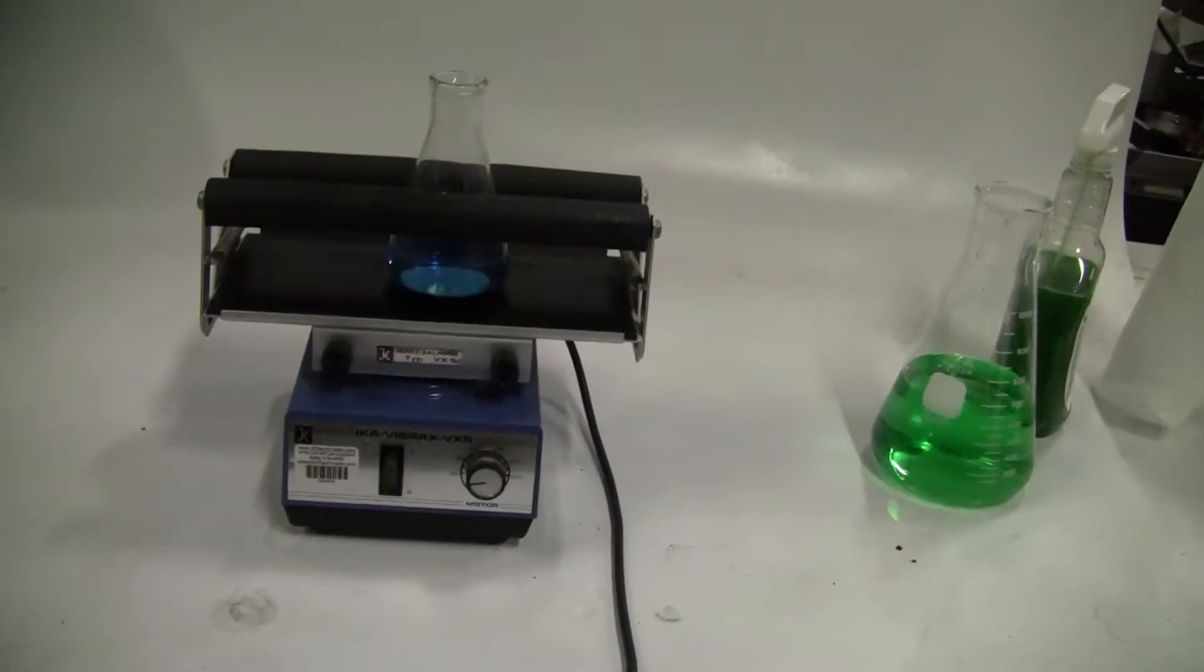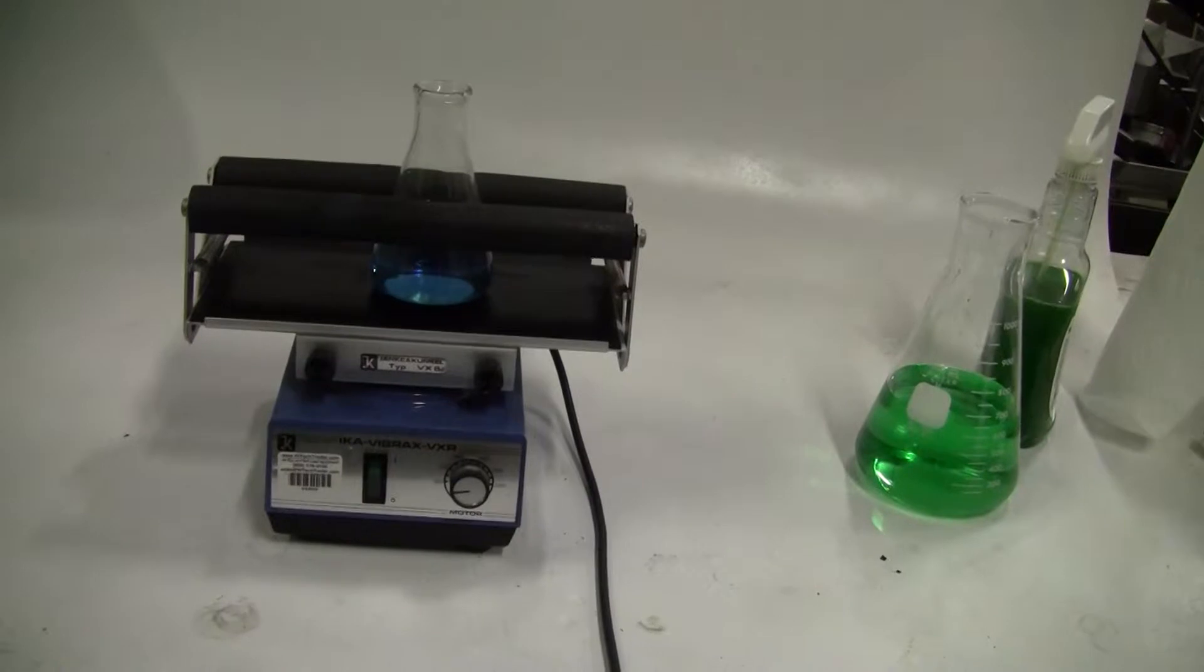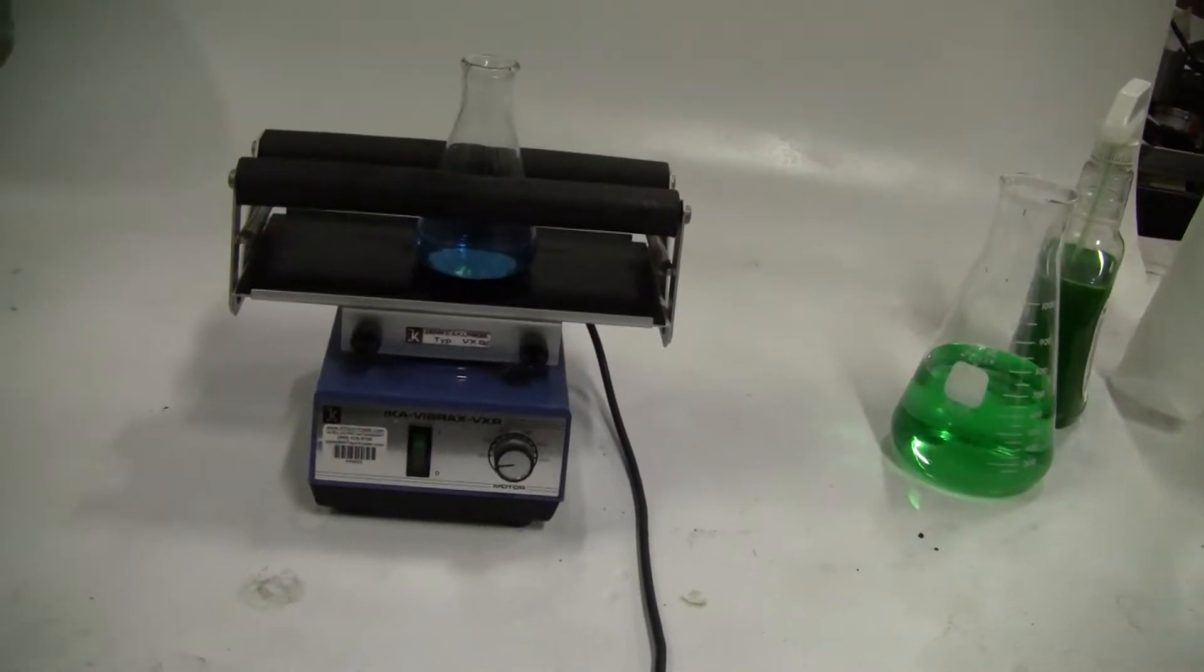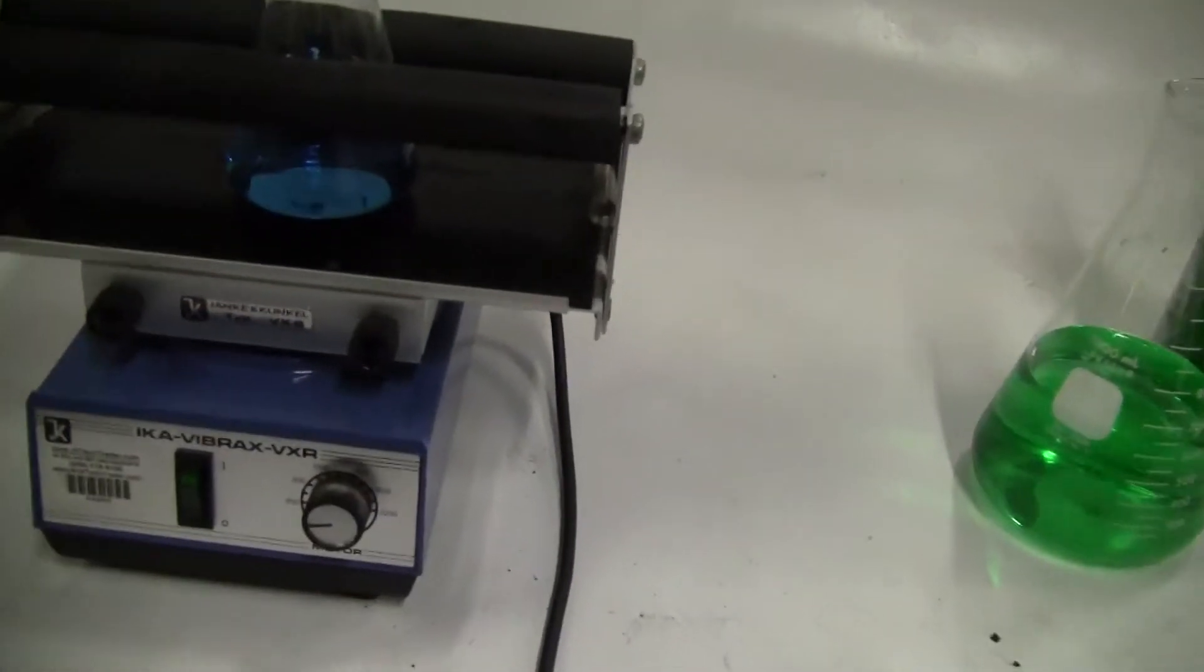Hi, this is Jim from HitechTrader. We're looking at an Ica Fiber Brax VXR orbital shaker. It goes to 2200 RPMs.